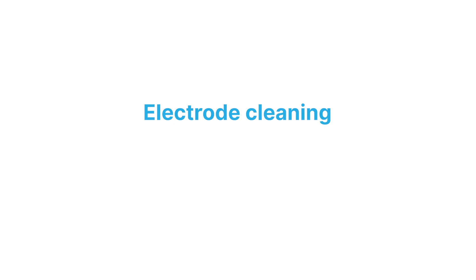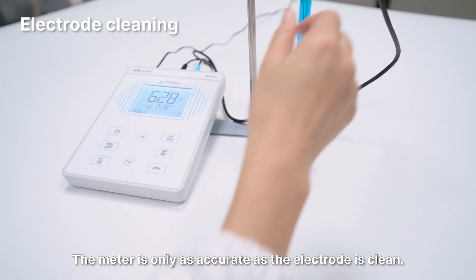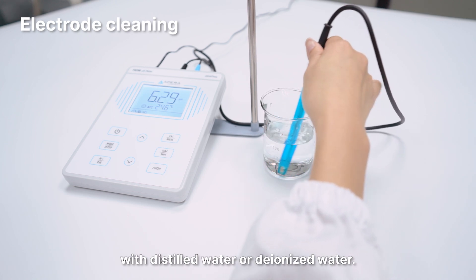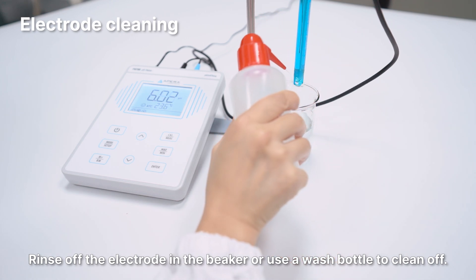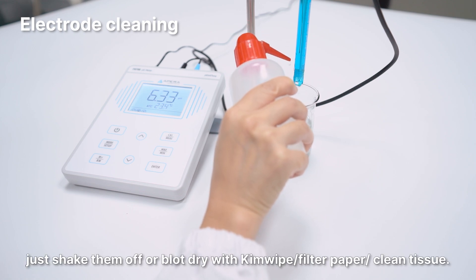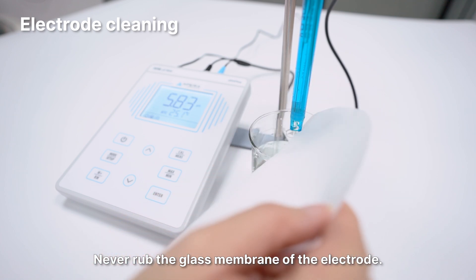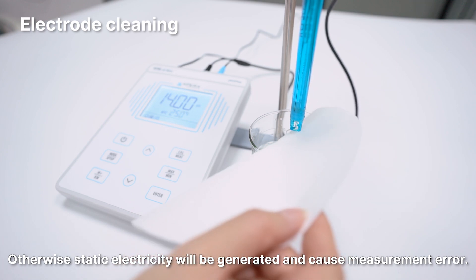Electrode cleaning. The meter is only as accurate as the electrode is clean. Always thoroughly rinse off the electrode before and after each measurement with distilled water or deionized water. Rinse off the electrode in a beaker or use a wash bottle to clean it off. To remove excessive water, shake them off or blot dry with kimwipe, filter paper, or clean tissue. Never rub the glass membrane of the electrode — otherwise static electricity will be generated and cause measurement error.